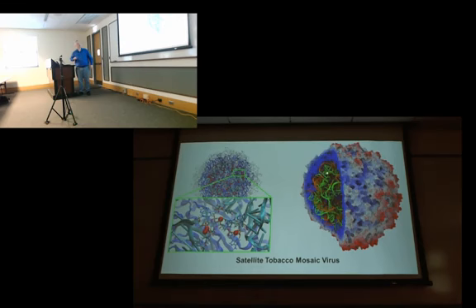This one is combining a radial coloring on the capsid to accentuate the extremities of the surface and their protrusions in space, in addition to the shadows that the ray tracing is giving it, right? So both of those things are now working together, and so you're emphasizing that information more by applying both the coloring and the shadowing algorithm at the same time.